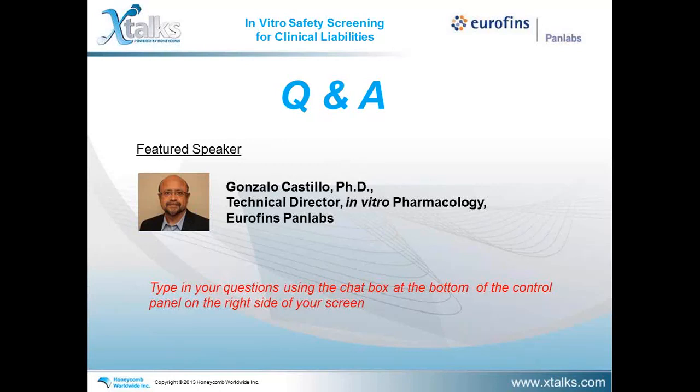Okay. Thank you. Our next question here: how do you relate the data with an in vivo effect if we have a compound that's having a nanomolar affinity in binding, but in functional reporter gene assay of a micromolar affinity? So, sorry, I was kind of paraphrasing there. I can repeat that if you'd like. Yeah, could you repeat that question? Yeah. How do you relate the data with an in vivo effect if we have a compound that's having a nanomolar affinity in binding, but in a functional reporter gene assay with a micromolar affinity?